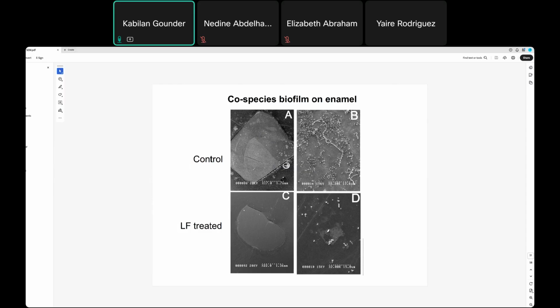Also, you can get the details of different materials, not only biological samples, but anything you want. So with this, we will complete the scanning electron microscope. So far we completed light microscopy, scanning electron microscopy, fluorescence microscopy, laser capture microdissection, and all these processes.